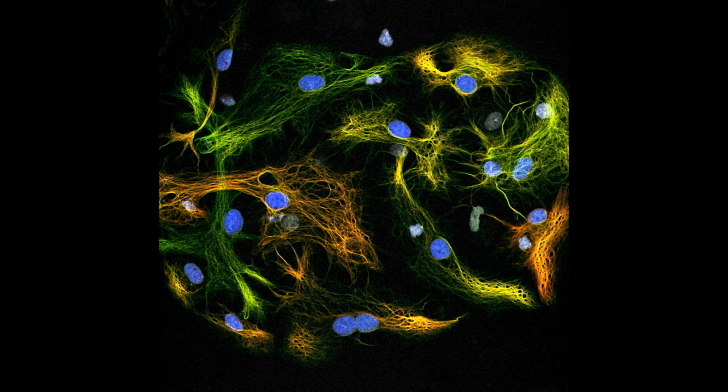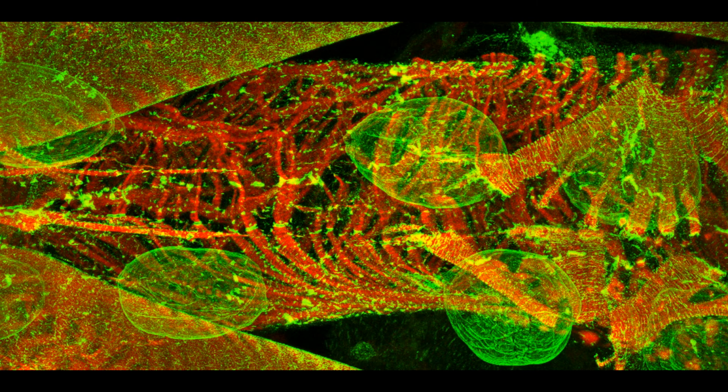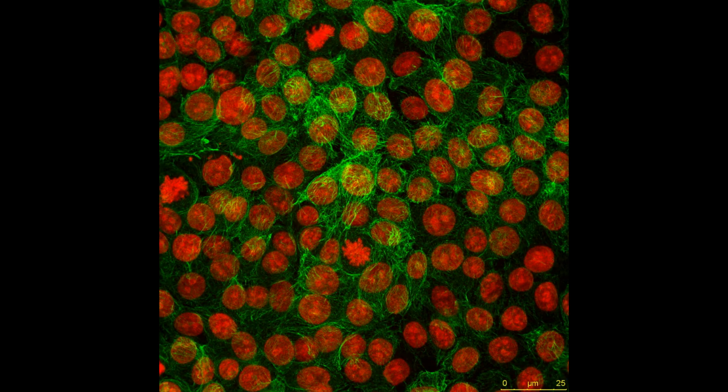Both microscopes work using fluorescence. We target the features of interest in our sample with very specific probes that fluoresce, that is glow, in a particular colour if they are exposed to light of a different particular colour. And then, by tagging different probes with different fluorescent dyes that glow in different colours, we can detect multiple different targets in our sample all at the same time.